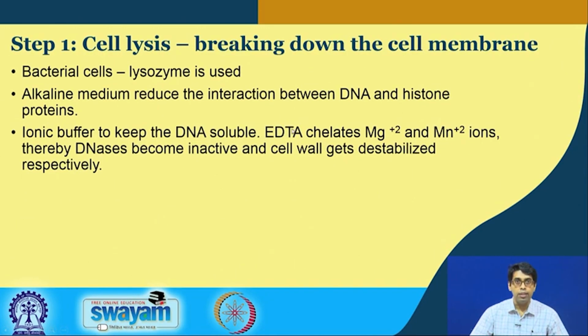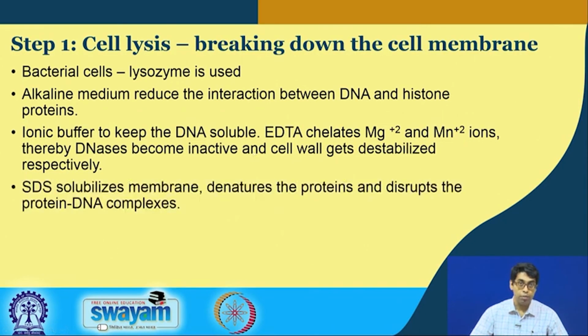Also, adding EDTA makes the cell wall of the bacteria unstable. So, it helps in both degrading the bacterial cell wall and also protecting the DNA from several enzymes.